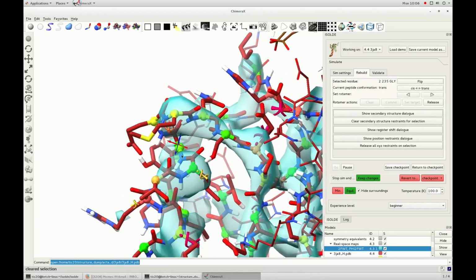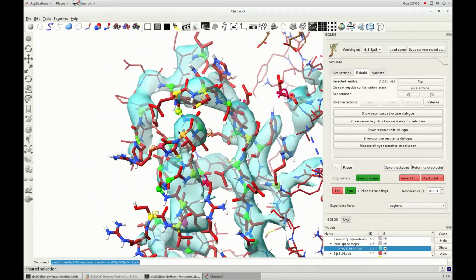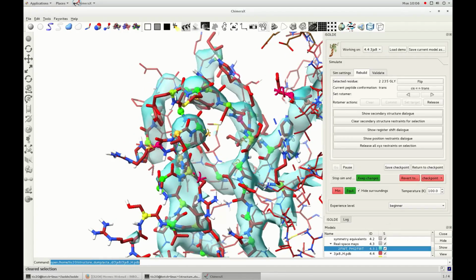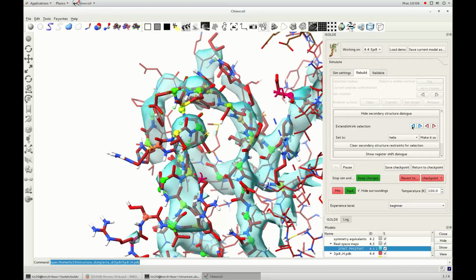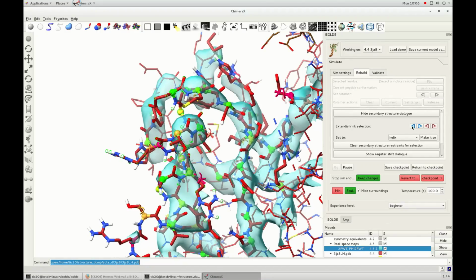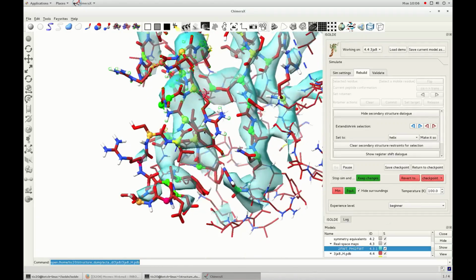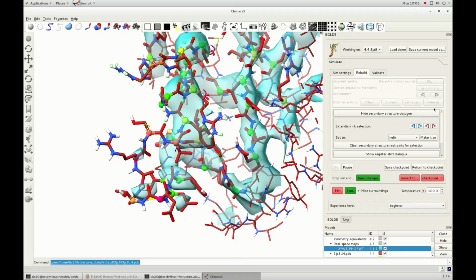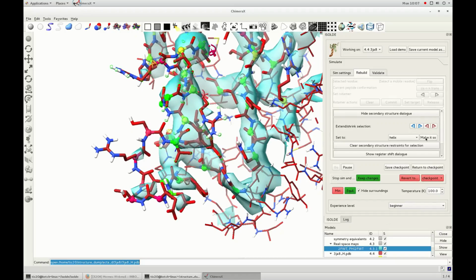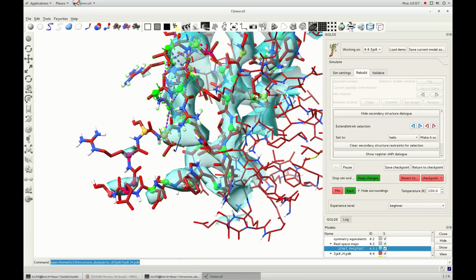While correcting these, it may be worthwhile to fix any other obvious problems you see, but I wouldn't recommend spending too much time wrestling with individual residues at this stage. First, it's important to remember the golden rule. Human eyes should see each and every residue in context at least once. In other words, we need to go through the model looking specifically for large-scale errors. There's no point spending all your time tinkering with the details if some large-scale change is going to wipe out all your hard work.